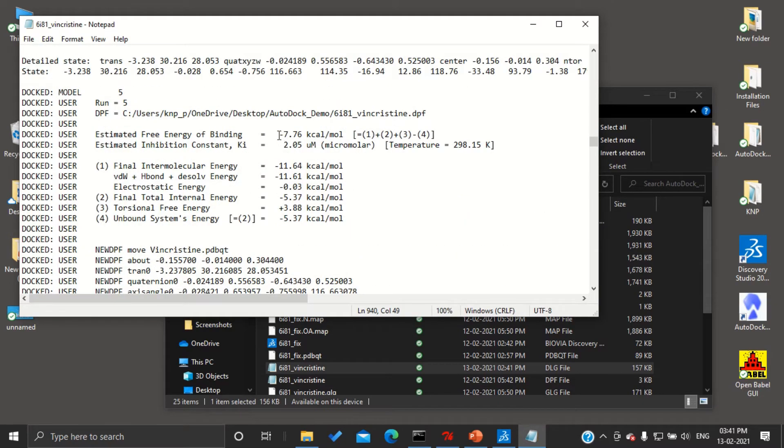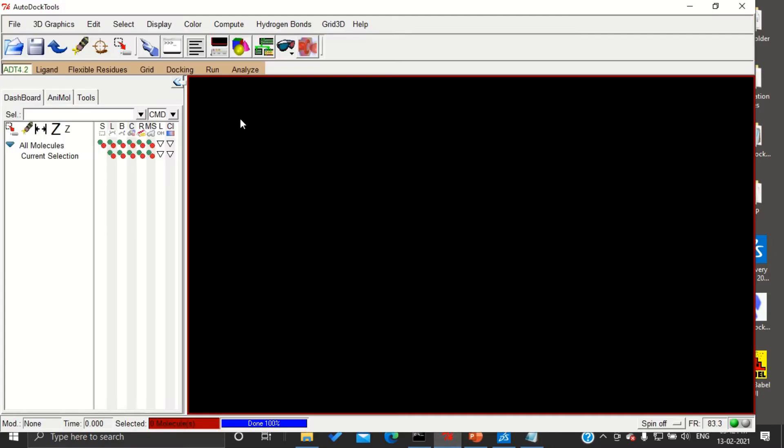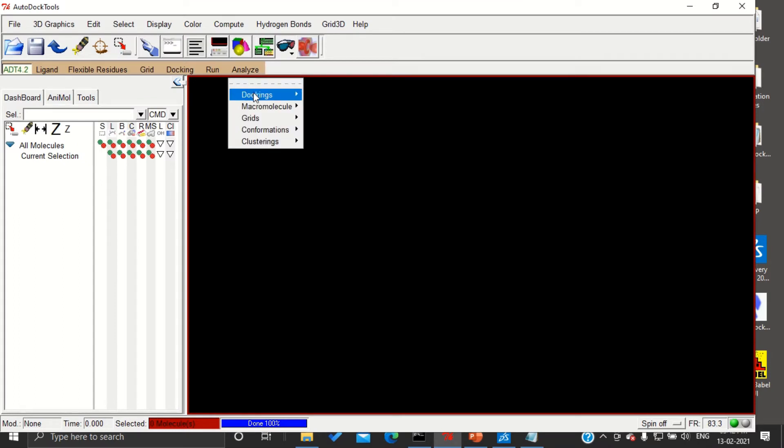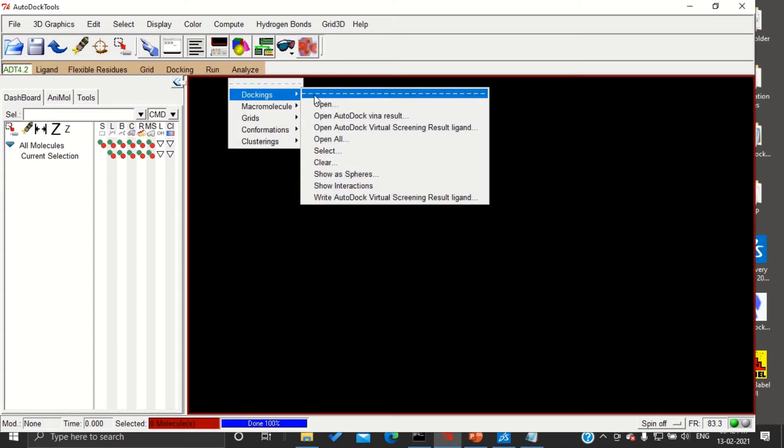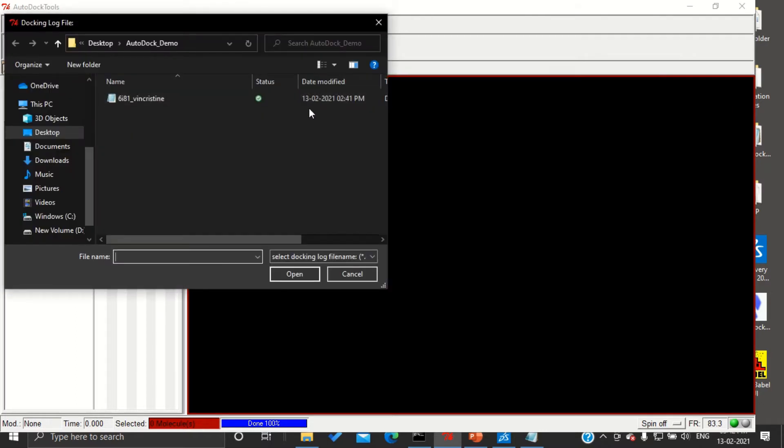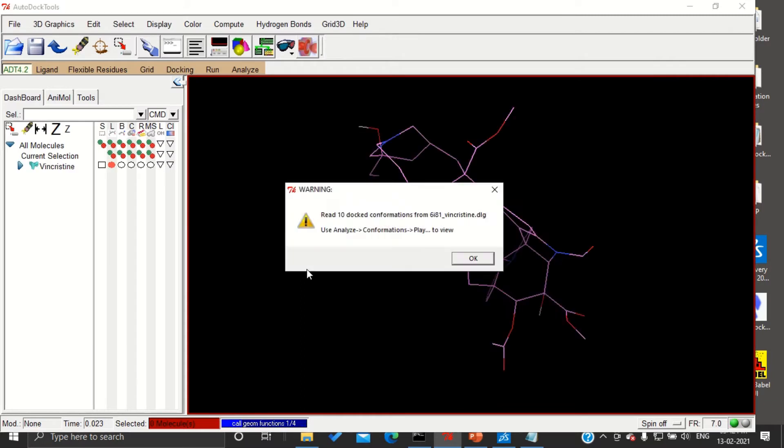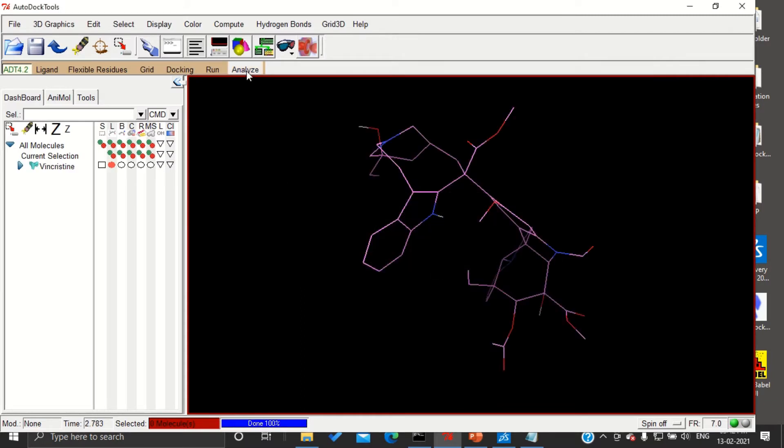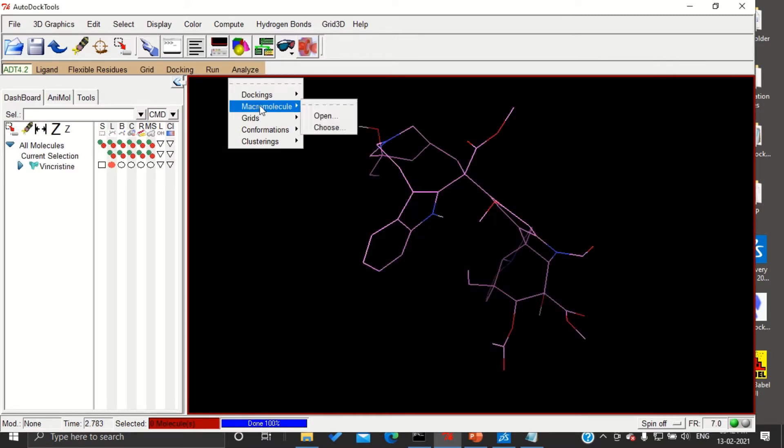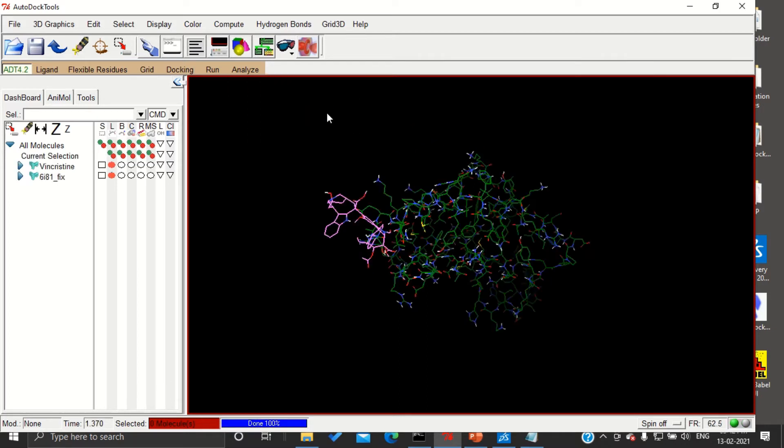Now if you want to visualize this result, we have to go to AutoDock. Go to analyze dockings, open, and here you can open our dlg file. Next, you need to open the macromolecule, that is our protein. If you press open, automatically it will be opened.